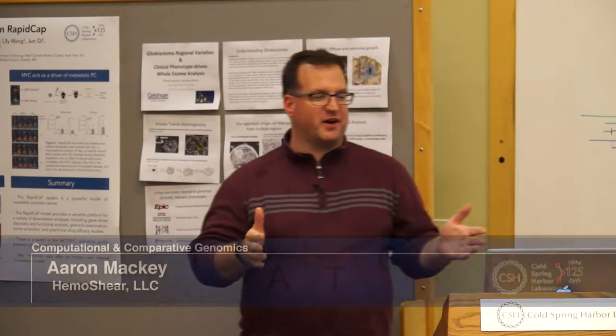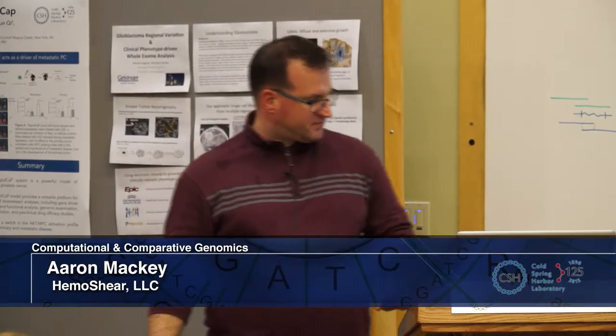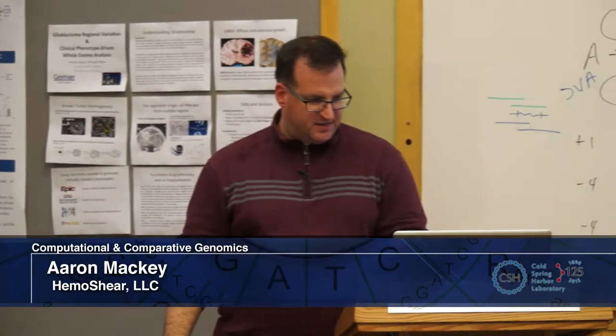So first I'm going to talk about next generation sequencing technologies, whether you call them next gen or second generation or third generation or fourth generation, is at this point kind of somewhat arbitrary. It's not like the cell phone technology where they roll it out and they tell you what the brand is. It just sort of happens. So we'll get into it.